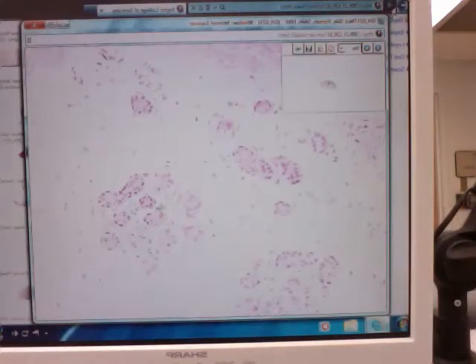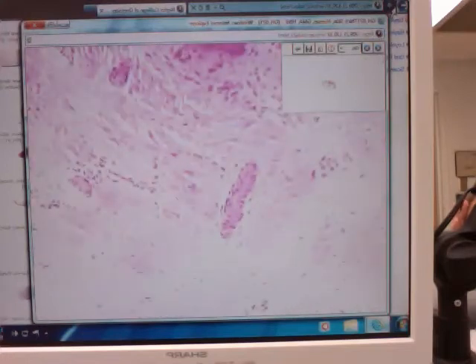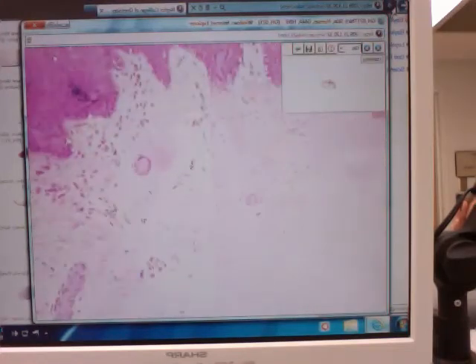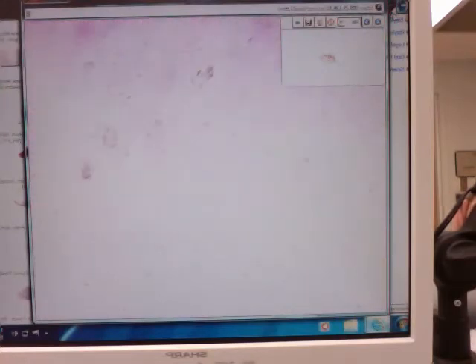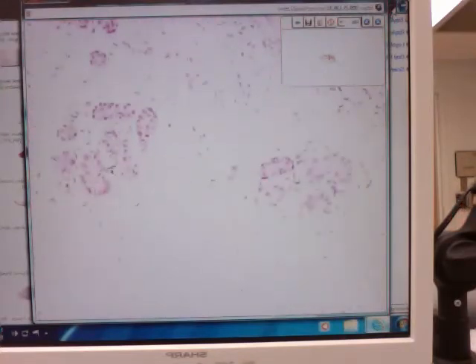But when you look at it, what you'll find is typically the areas that are lighter staining, more paler staining in comparison to particularly when you get up into places like this. It's all still pieces of that same thing, darker staining compared to these guys. These are the secretory portions of the gland. And then you always remember D&D, duct darker. The duct stains darker.